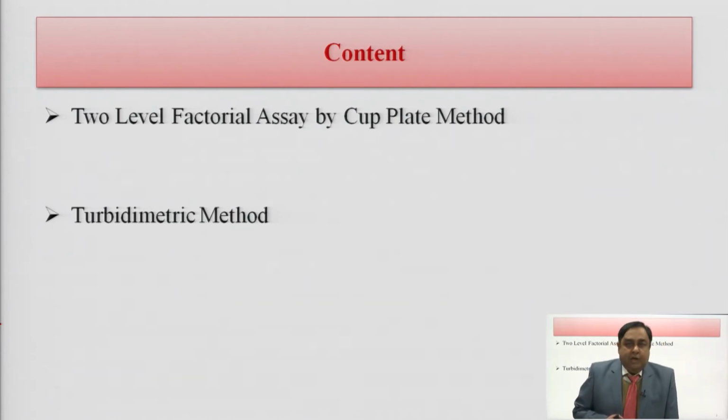So, we are taking the help of solid nutrient agar media, and in case of the other method, which is called the turbidimetric method, we are utilizing a liquid media, and in this particular liquid media we are measuring the turbidity. But the principle remains the same.